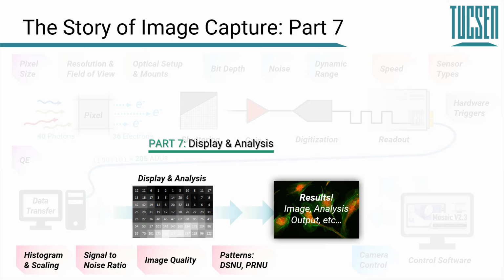The first of those aspects is signal-to-noise ratio, and we've mentioned this quite a few times already in this course because it's such a fundamental and important aspect of imaging that we have a good or at least adequate signal-to-noise ratio in our images. And we're going to be exploring exactly what this means and how to calculate it. There are, in fact, quite a lot of misconceptions and misunderstandings in the imaging world about how to calculate it and what it represents.